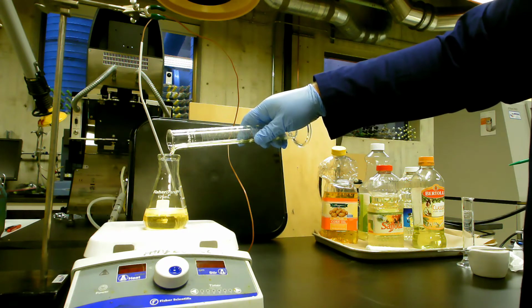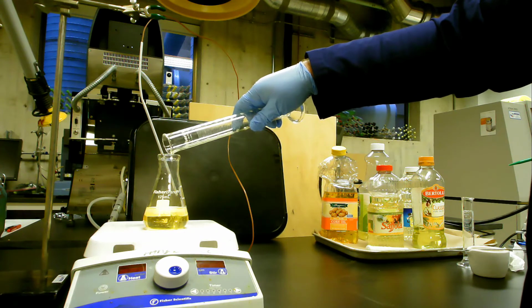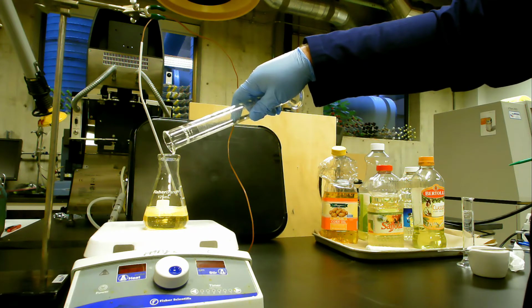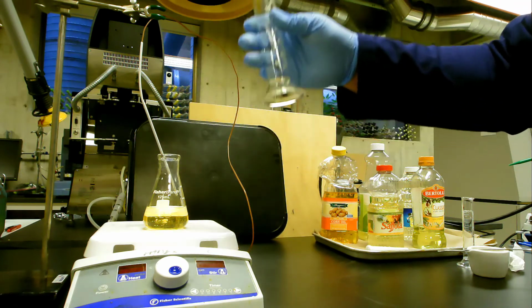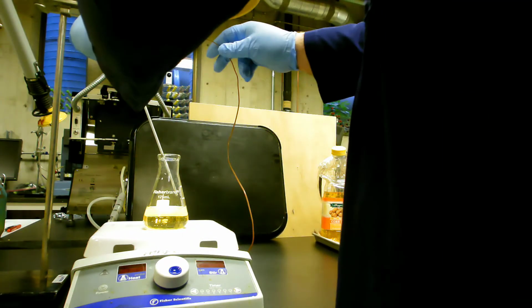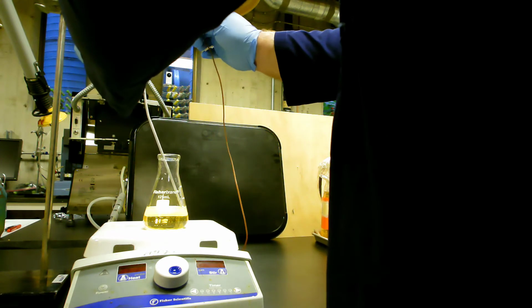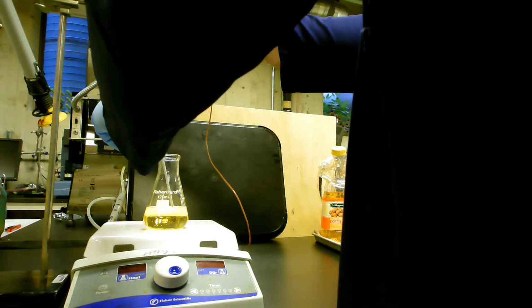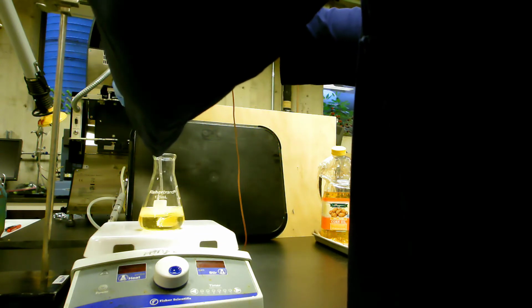We're going to ramp the heat in 2 separate steps because it tends to overshoot a little bit. So we need around 50 degrees C for the best conversion, and so we're going to first set it to around 35, let it hit that, and it's probably going to overshoot, and then we'll set it to 50 and it'll get there more slowly and more accurately. We're also going to stir the solution such that it is not too vigorous, but also we want it to be mixing thoroughly. Once we've reached temperature, we're going to allow it to heat for 20 to 30 minutes. Usually I go on the longer side to get better conversion, and then we will pour it back into our large graduated cylinder, which we will have cleaned for the separation, which happens overnight.